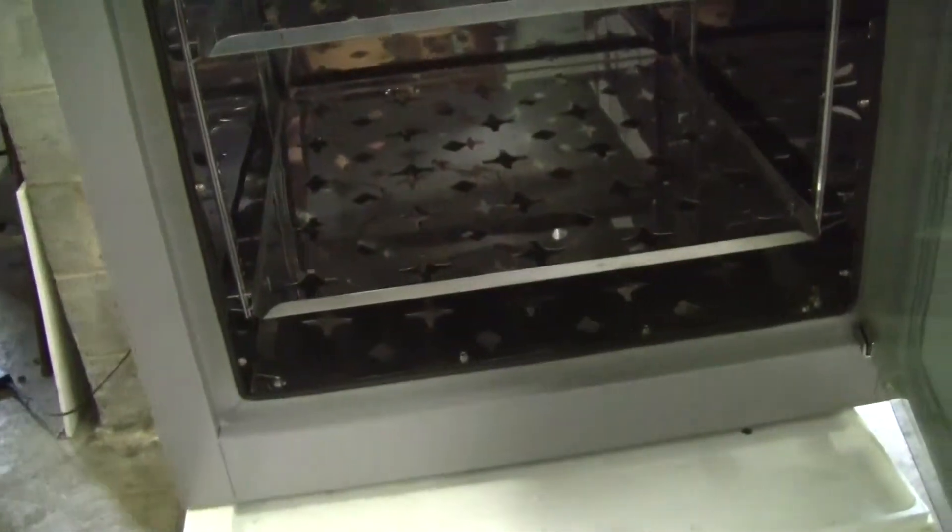Taking a look on the interior, this particular unit has three shelves. It's very clean inside. Blast door, good shape. Seal looks good.